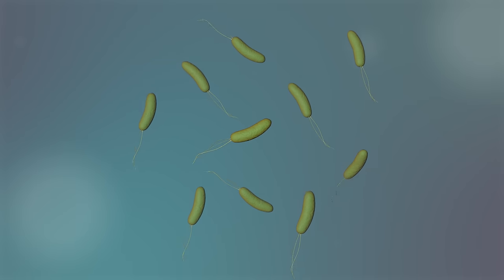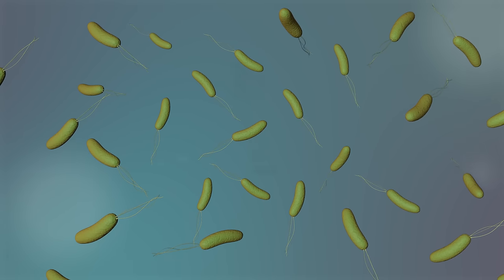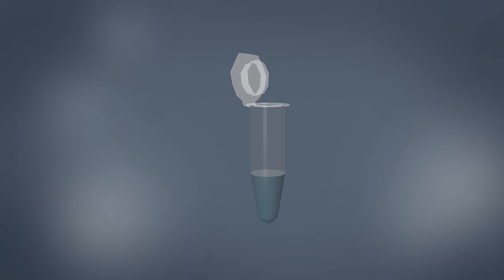This makes it possible to produce lots and lots of copies of it as the bacterial cells multiply. The DNA is then isolated from the bacteria and sent for sequencing.